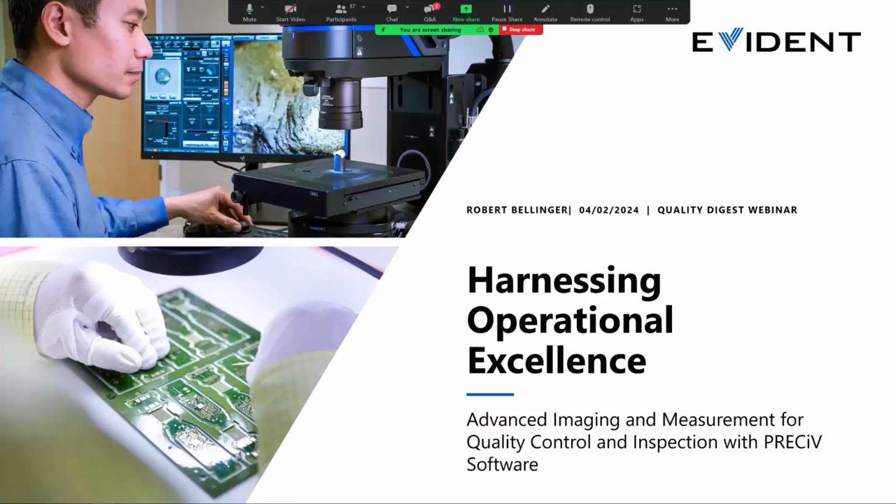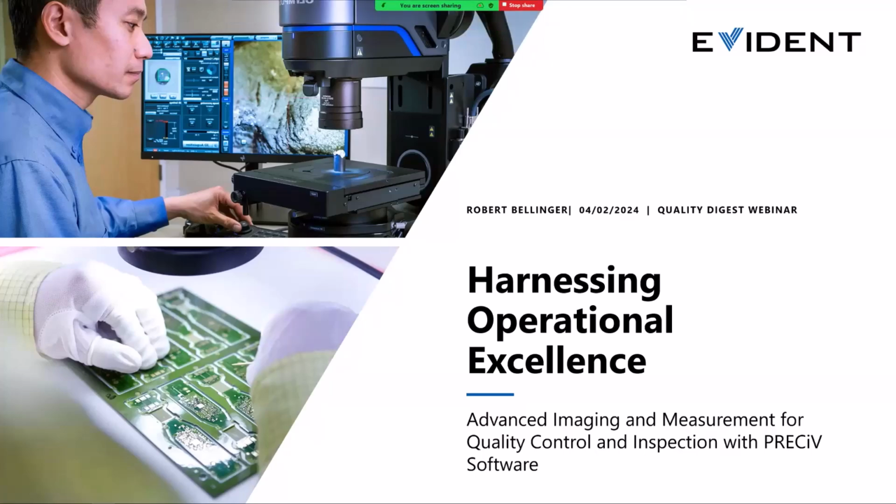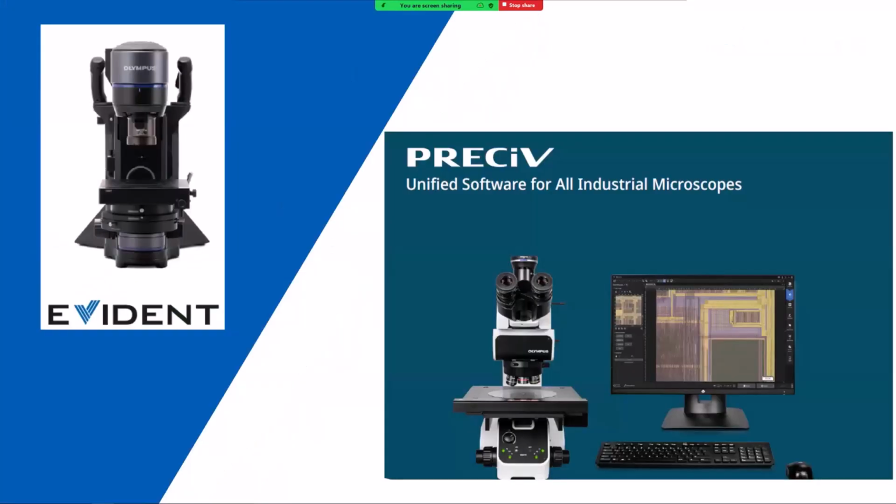Harnessing Operational Excellence, the name of the webinar here. I'll be talking about some of the advanced imaging techniques and measurements for quality control and inspections with our latest software named PRECiV. PRECiV is a unified software for all of our industrial microscopes, everything from your stereo microscopes, semiconductor microscopes, metallurgical, upright, compound, and inverted microscopes, and even our fully digital microscope.